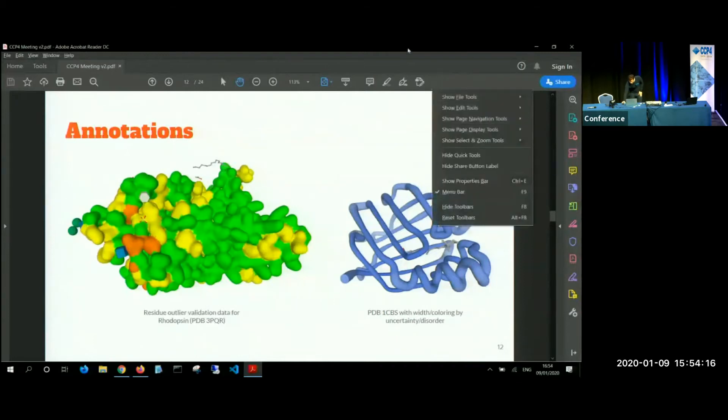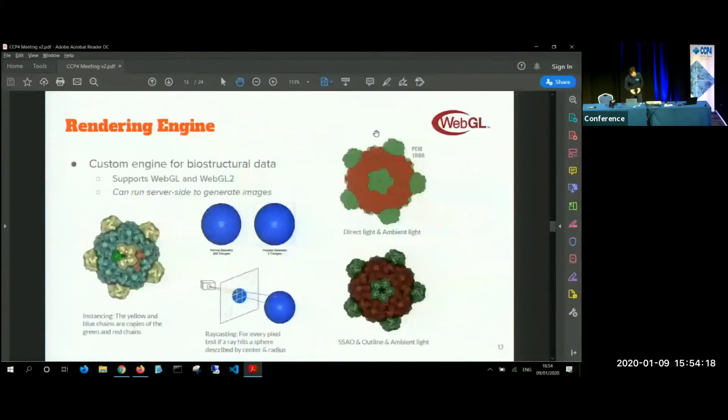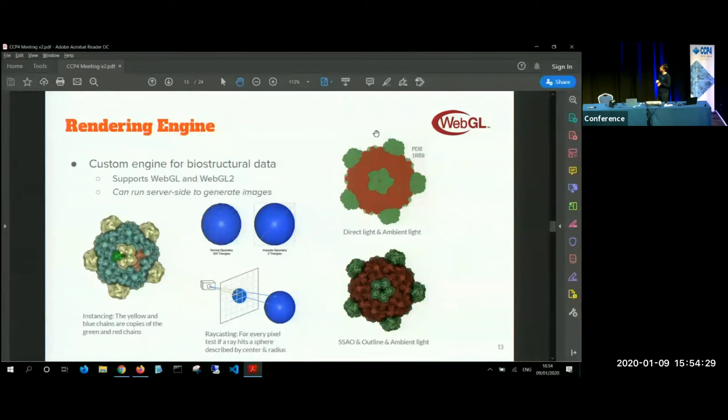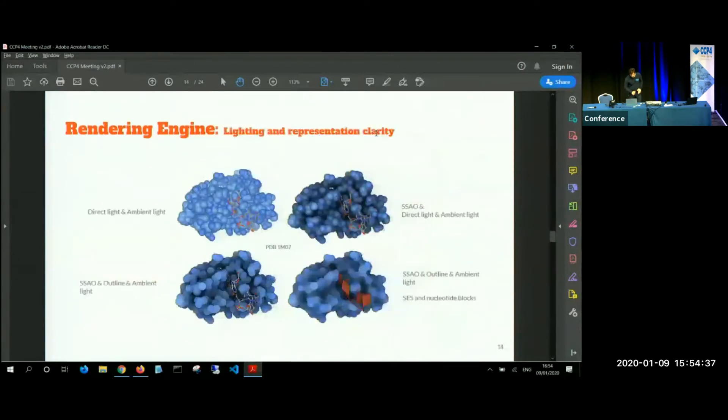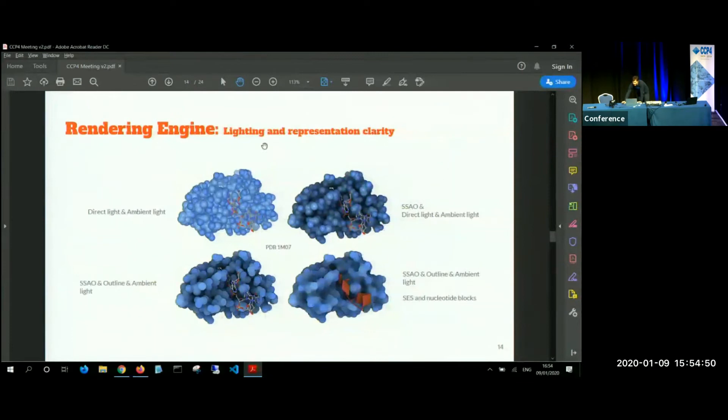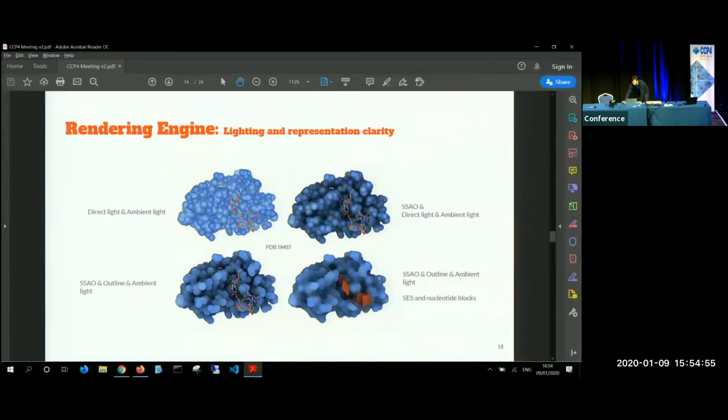And yes, so the way this is achieved is we have written a custom rendering engine in WebGL, which allows things like instancing imposters to reduce the amount of geometry. And it can even run on a server side to generate images. It's a project called mol-render. And here it showcases how important is lighting of your model. So normally most of the other browser, most of the other tools, we just allow you to show direct and ambient lighting. And with more modern rendering methods such as ambient occlusion and better lighting, we can see that the features of the structure and interacting parts come out much nicer.